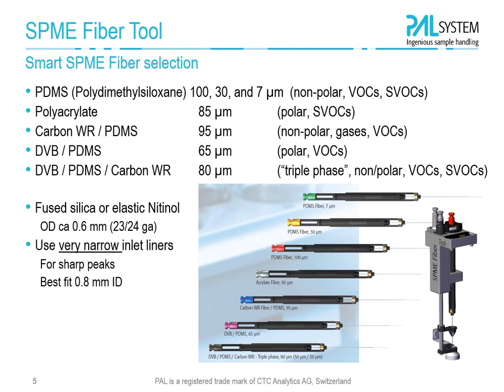On the right side, we see the PAL SPME tool. The SPME fiber devices are pre-mounted and look like a syringe, and they are inserted into this tool also like a syringe. The plunger heads are color-coded to distinguish the coatings.